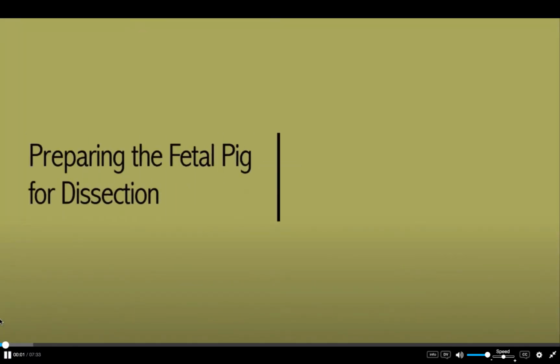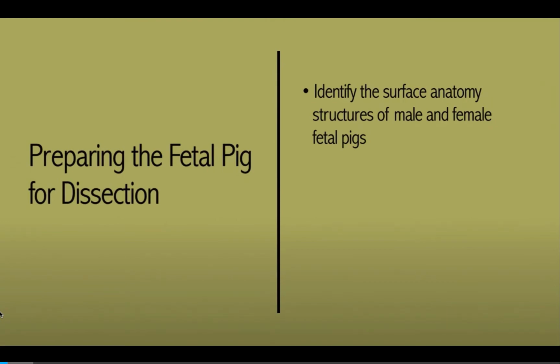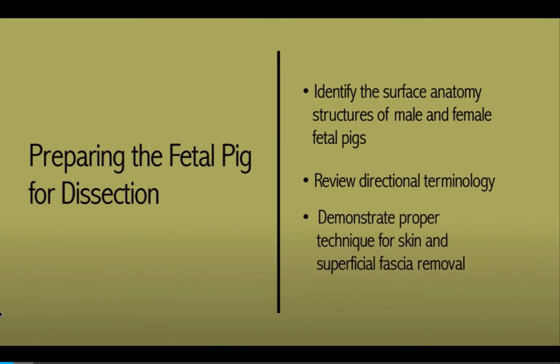Preparing the fetal pig for dissection. In this video, we will identify the surface anatomy structures of male and female fetal pigs, review directional terminology, and demonstrate proper technique for skin and superficial fascia removal.